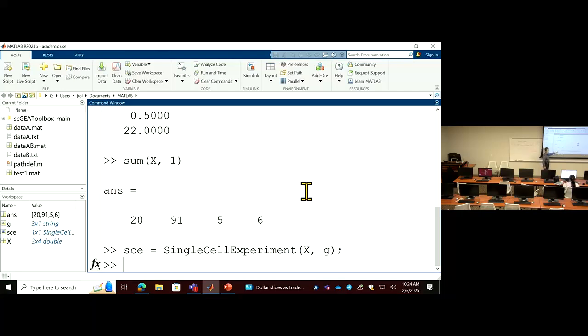Once you have this, you can start to use the toolbox to manipulate everything's content inside here. Any future annotation, cell properties, or other statistics will be inside this one. Right now, this one only contains two matrices, one matrix and one vector.